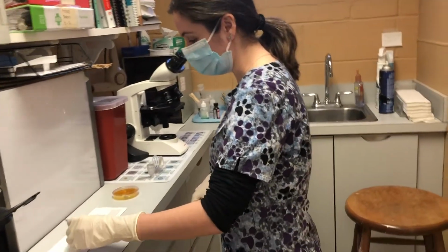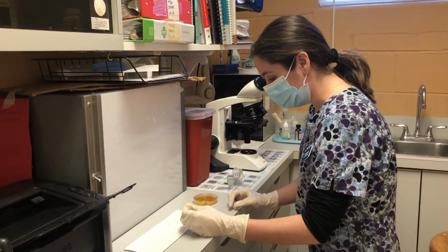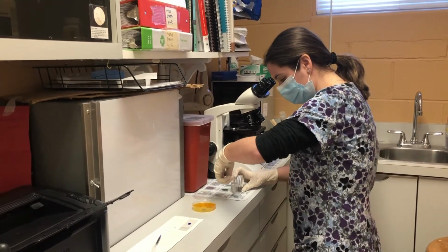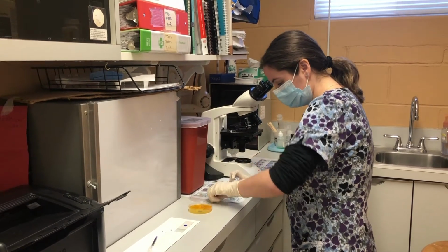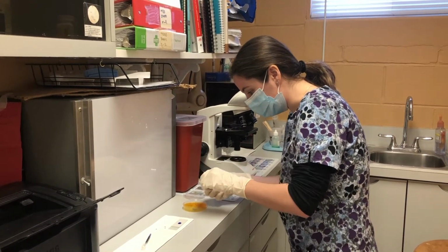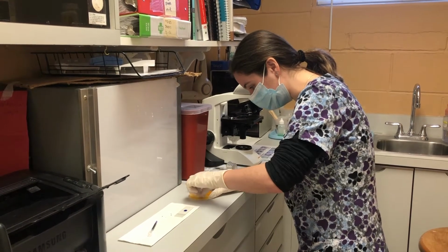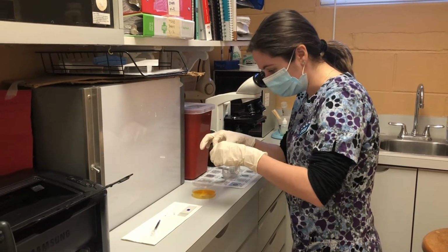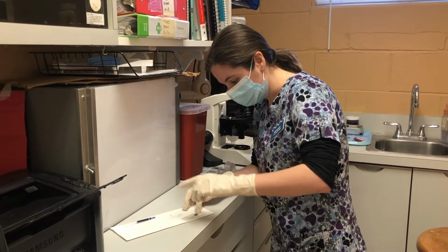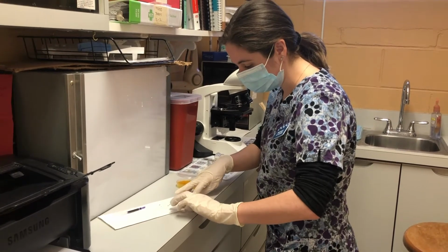So the first thing I'm going to do is take my methylene blue dye and put a drop of that in the middle of my slide. And I'm going to take cellophane tape, and I'm going to put it sticky side down into my medium so that any spores will get picked up by the sticky part of it. So now I'm going to place that onto my slide, sticky side down, and it acts as its own cover slip.